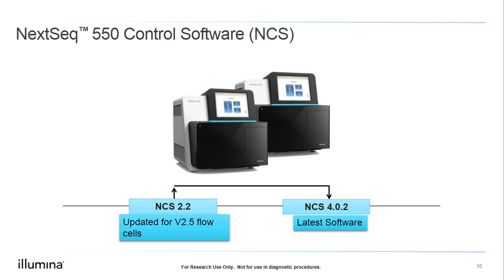If you would like to upgrade to NCS version 4, please discuss the upgrade with your field team. The upgrade is free if the instrument is on an active warranty and is a paid upgrade for instruments not on contract. Please call tech support for any questions.